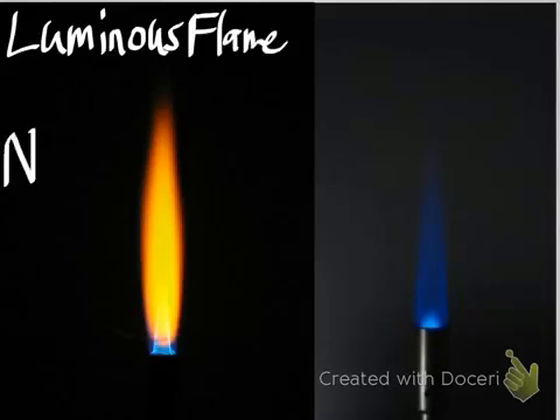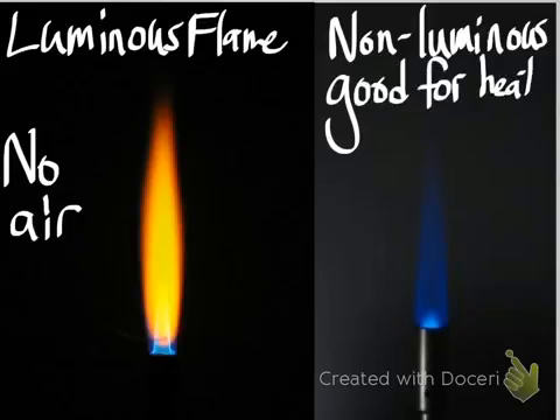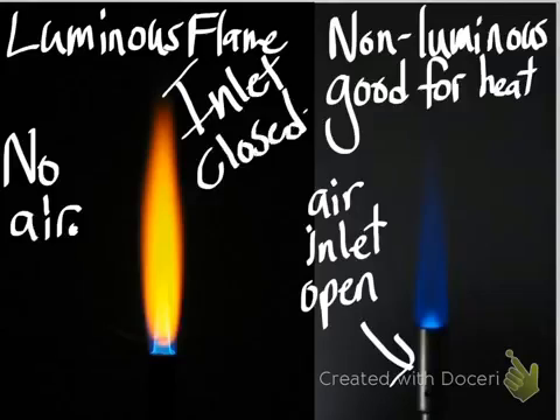Once you get your burner lit, it will look like the luminous flame on the left because the air inlet is closed. What we want is a non-luminous flame, which is better for heating. Open up the air inlet a little bit to get a nice blue, hot flame. Do this gently — the inlet doesn't really get hot — because if you add too much air, it can blow your whole flame out and you'll have to start over. On the left is the luminous flame with no air; on the right is the non-luminous heating flame with the air inlet slightly open.